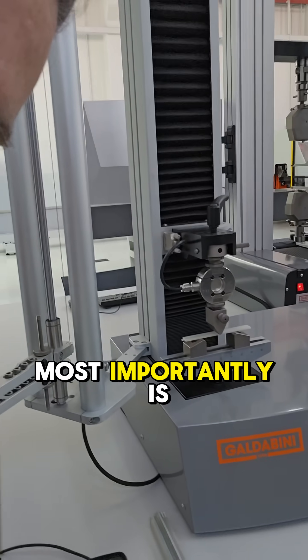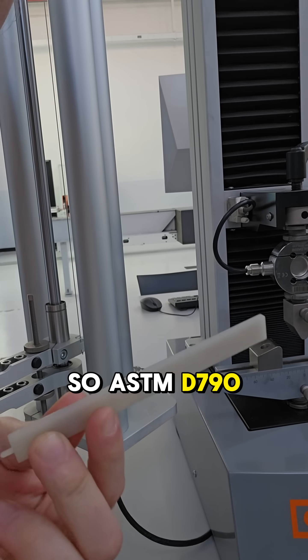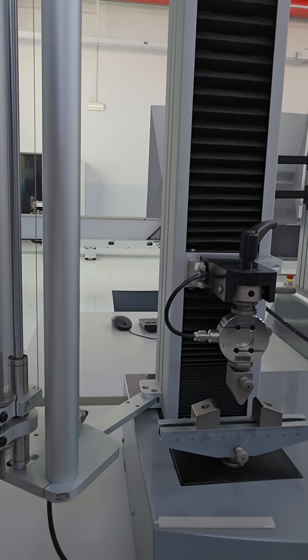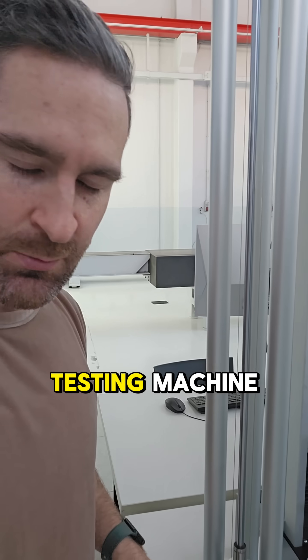First and most importantly is the bend fixture, and then of course the plastic sample. ASTM D790 is a bending test, or a flexural test. Put the sample onto the fixture, and then we have our load cell and testing machine. Today we are using the Galdabini 2.5 kilonewton testing machine.